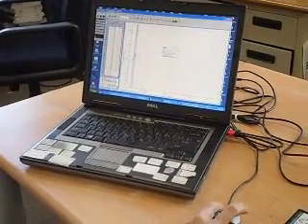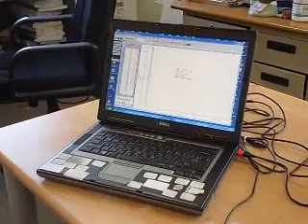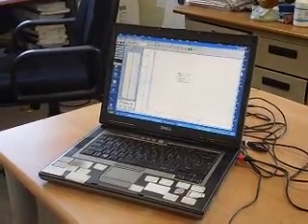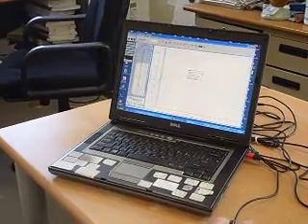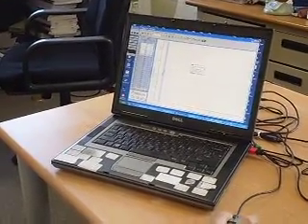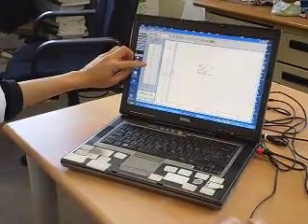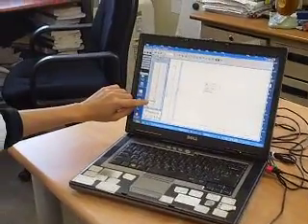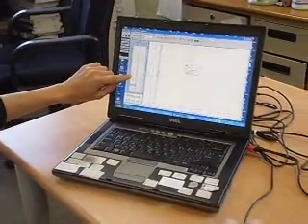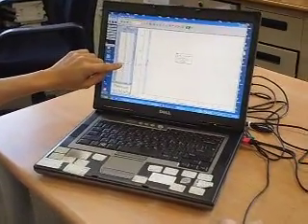Second one, I want to measure the rate of reaction for my second experiment now. So I get into my second data collection. I check now when the reaction starts. I get back to my old data. 101. So it starts at around, again, 44. Sorry, it's at 38. At 38 seconds, the pressure starts to build up now.